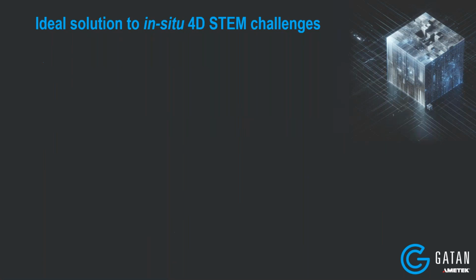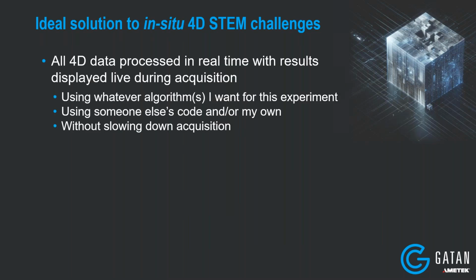So what is the ideal solution to these in situ 4D STEM challenges? I've talked about what is difficult, but how do we solve this? What would be the ideal approach to overcoming these?